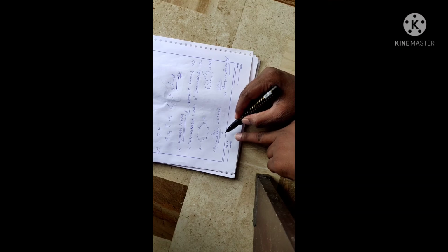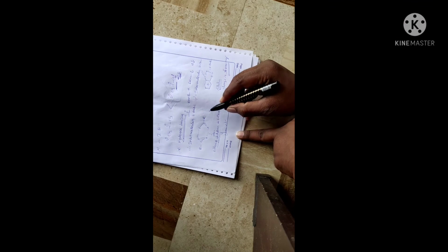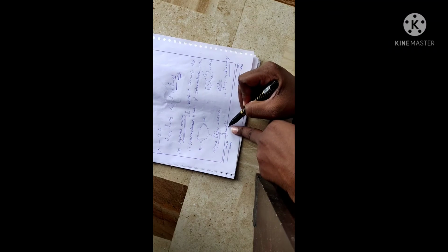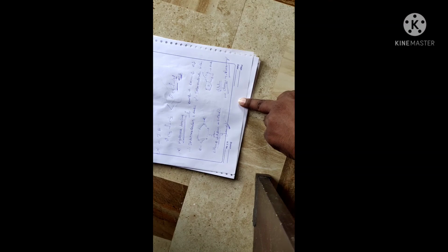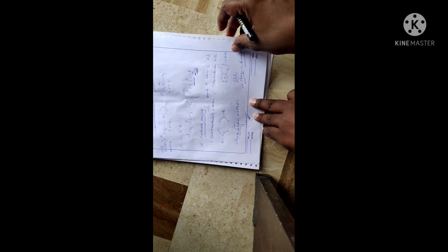But in the case of intermolecular hydrogen bonding, as we are diluting the solution, there is a change in the frequency, because due to dilution the two molecules go away from each other, and with this the frequency changes. In intramolecular hydrogen bonding, there is no change in the frequency. Okay, this is the effect of hydrogen bonding on carbonyl frequencies.